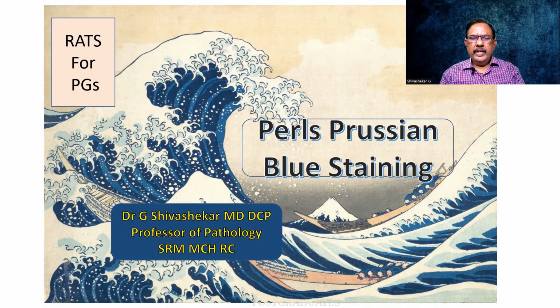Today, we shall deal with an important practical topic which can come as an ancillary exercise for us in the university exam. The PERLS Prussian blue stain. PERLS as such is the name of a person and there is no apostrophe as such.